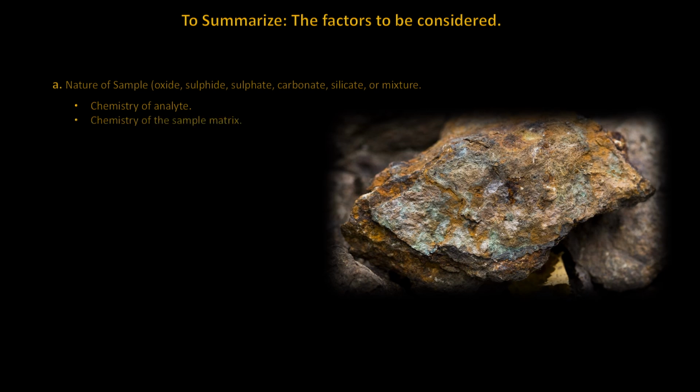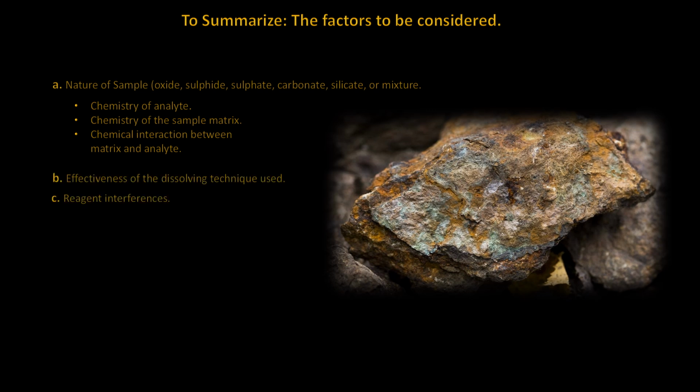How effective will your technique or choice of dissolvement be? Will there be any interferences from the reagent that you are going to use? More on interference in a later presentation. But for now, will there be any unwanted contamination of your sample, either from the reagent itself or from the equipment that you will use to dissolve the sample in?